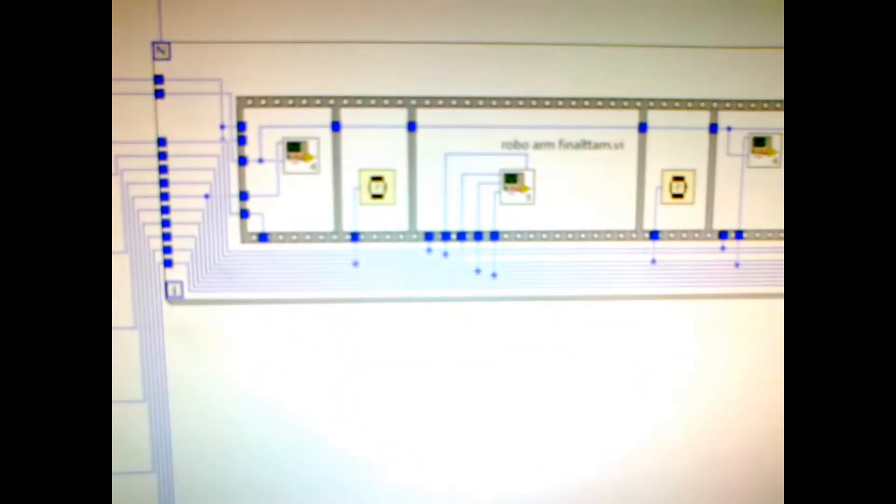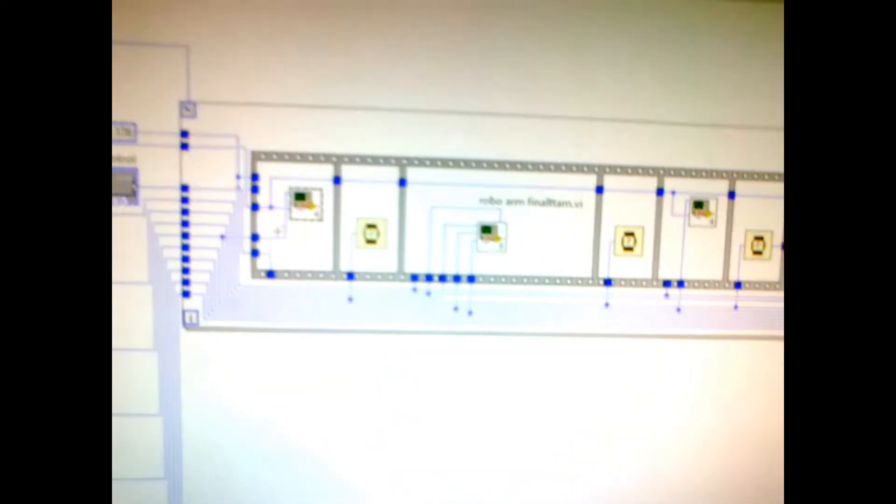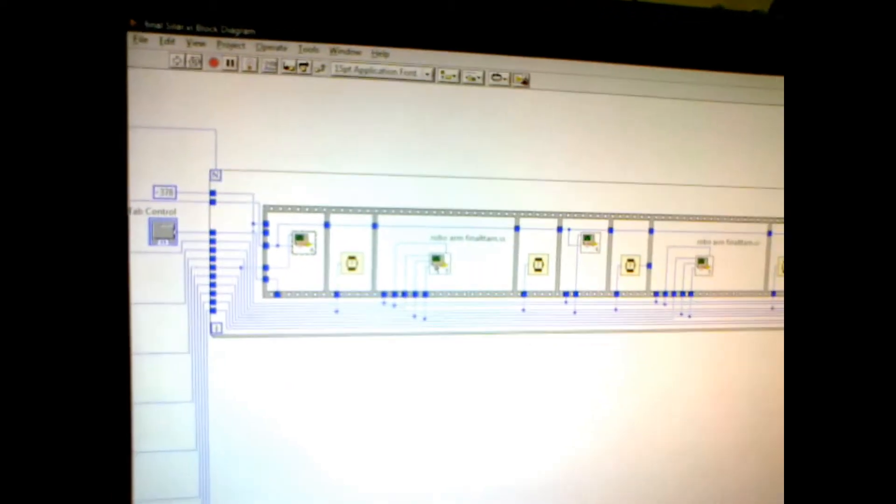The first tab is for the rotation of beakers — a stepper motor controlling beakers. Another tab contains all the parameters for setting time constants, time delays, and number of steps for the robot arm. This also shows the number of cycles used. In SILAR, optimization is done by varying the number of cycles, concentration, and similar parameters. This is the block diagram — we have used two types of sub-VIs.